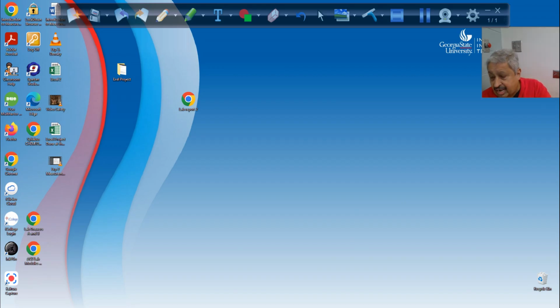It says that we have to do an unknown A. I don't think so. We'll have the time to do those all 1, 2, 3, 4 for density. If we have time, we will do unknown A. Correct? You know how to do this unknown A? I need the density of this unknown. Somebody will tell me how to do it. This is unknown A. So let me look at how we do it. We'll not do it, that's the easiest one.